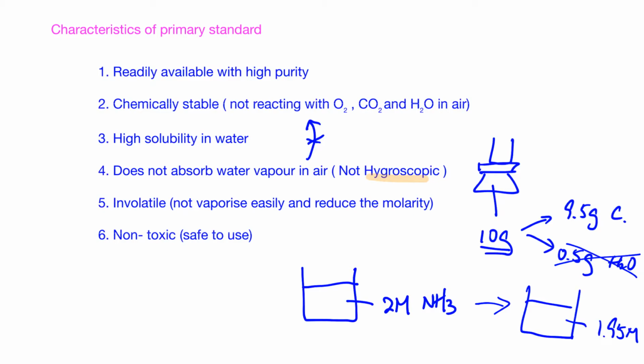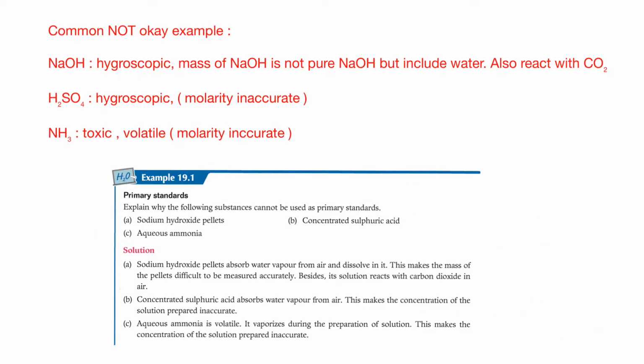Finally, the chemical should not be toxic. We have to be safe using it. According to the criteria listed in the previous slide, some of the chemicals are listed as not good examples, commonly seen in the public exam as well.